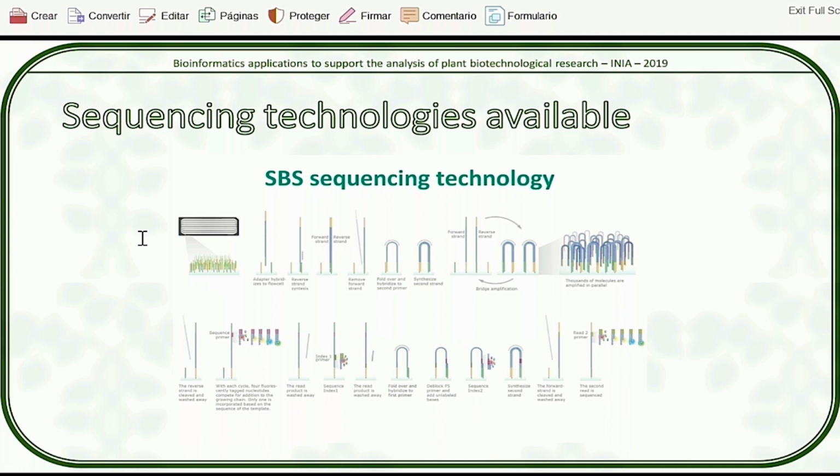But right now, you can find machines that can produce reads up to 300 base pairs. I don't know if they've gone any further, I don't think so. But up to 300 base pairs. But that's their limit. There are optical limits and physical limits to how much sequences using this sequencing by synthesis technology can achieve. You cannot go any bigger, because the bigger the template that you're sequencing, the more likely the color is going to be read from a different coordinate in the flow cell, and if you're reading it from a different coordinate, there is a higher chance that it's going to be erroneous because it's going to be crossing with another bit in the same flow cell.